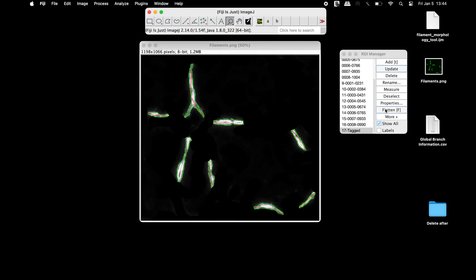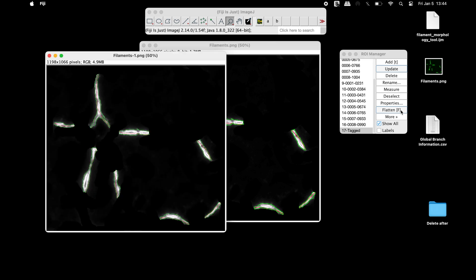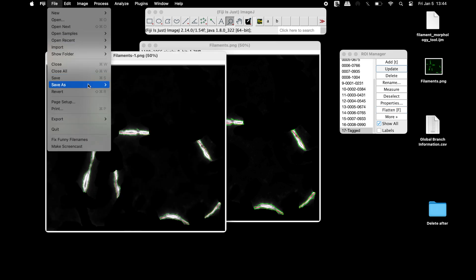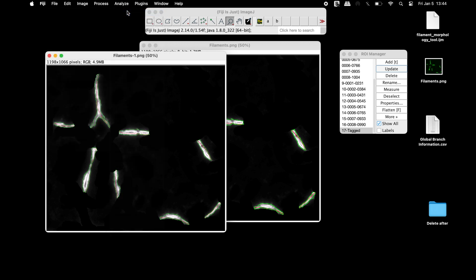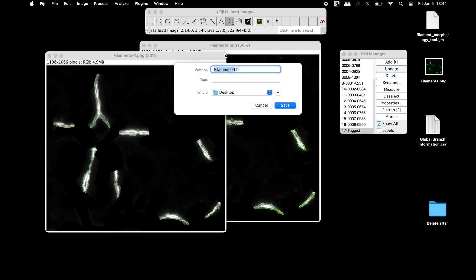Next, click on Flatten in the ROI Manager window, and the image can be saved in any format of your choice.